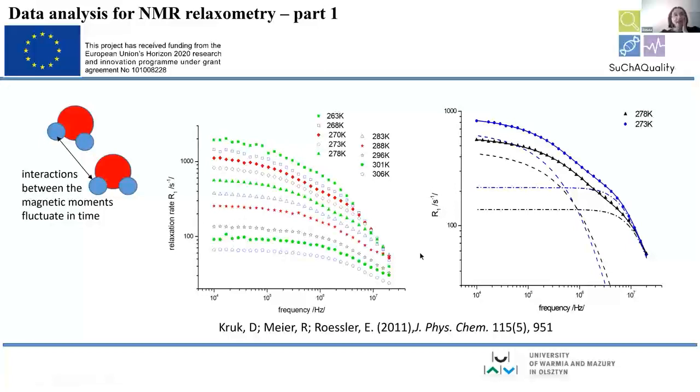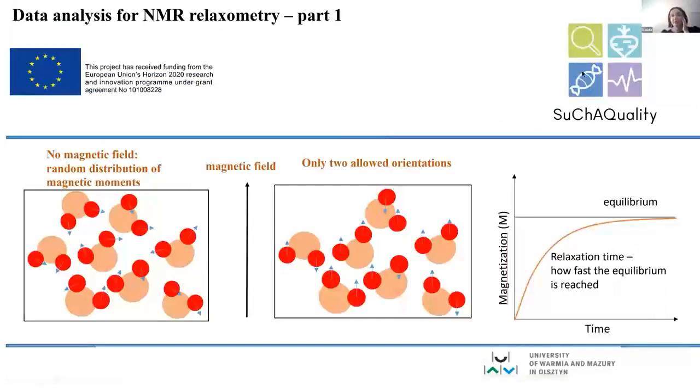But the point is that everybody knows that NMR relaxation, NMR relaxometry gives information about molecular dynamics. But the point is how? What do those quantities have to do with molecular dynamics? One can accept that the magnetization evolves because we change the magnetic field. Great. Okay, we can accept that it takes some time. Also great. Okay, the time is called, for a kind of strange reason which nobody can understand at this stage, spin lattice relaxation time or rate. But what has it to do with dynamics?